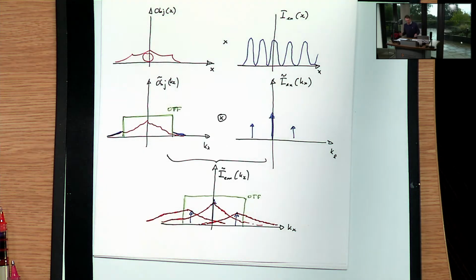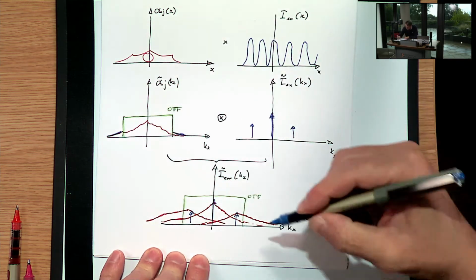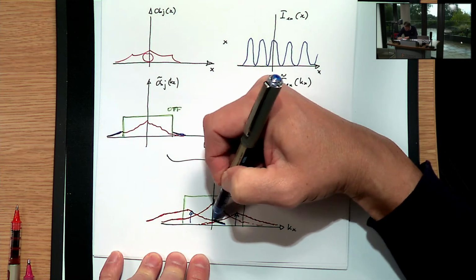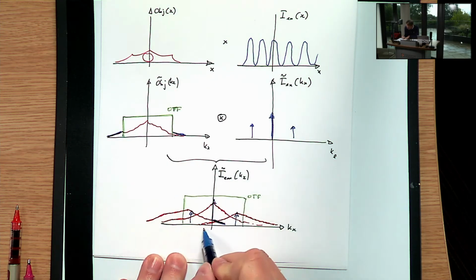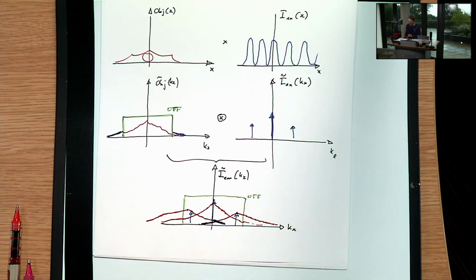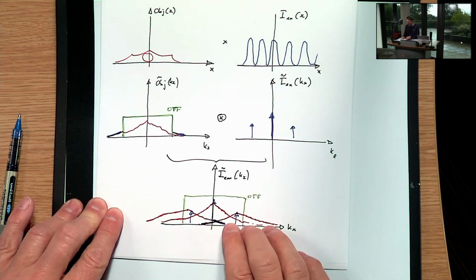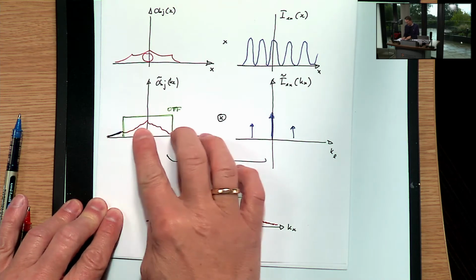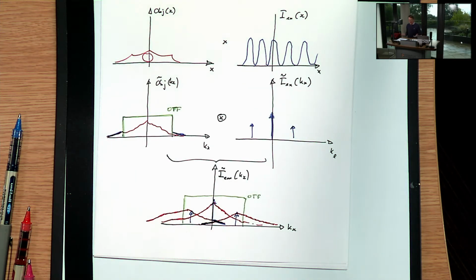So what have I won? Well, you can see this now very clearly. In fact, by doing this trick, this tail here has now shifted into the passband of the microscope. And conversely, this tail here has been shifted into the passband from this other side, simply by putting copies of this original spectrum and displacing it. You're shifting this thing into the passband, and shifting it the other way shifts this part in, and therefore you get extra high frequency content into the sample.